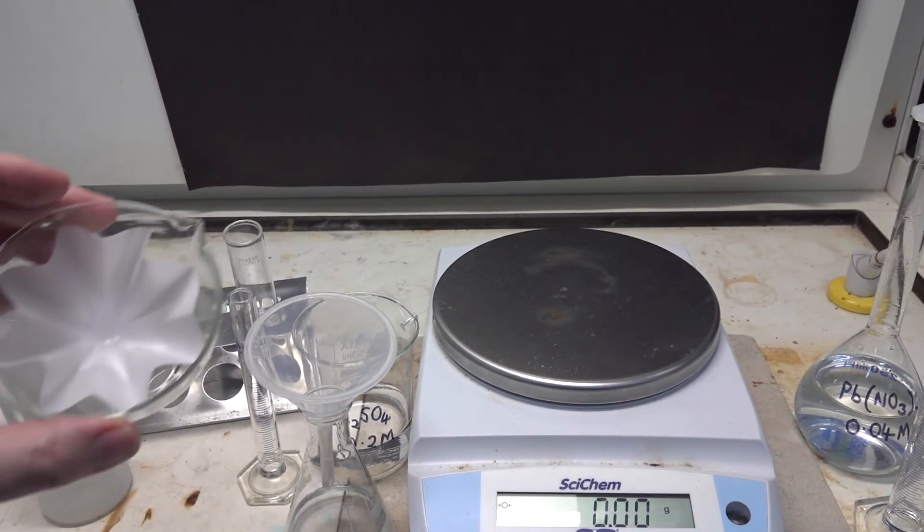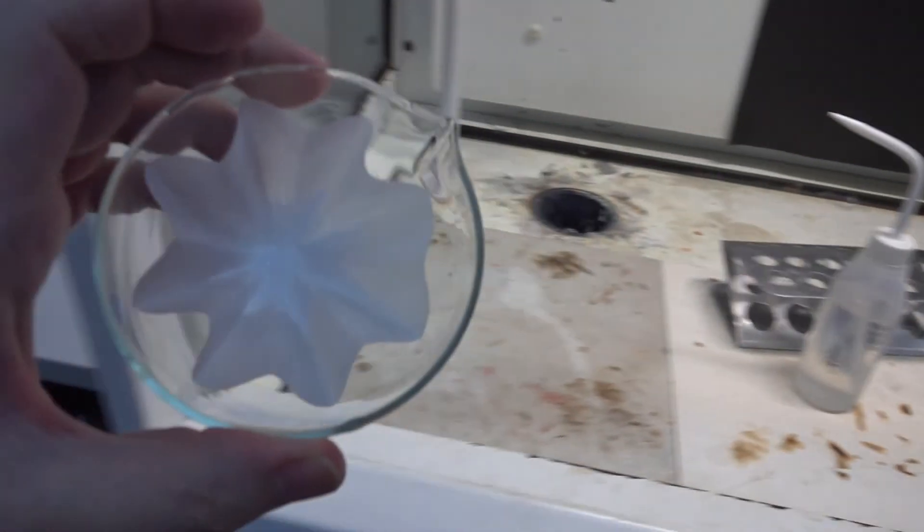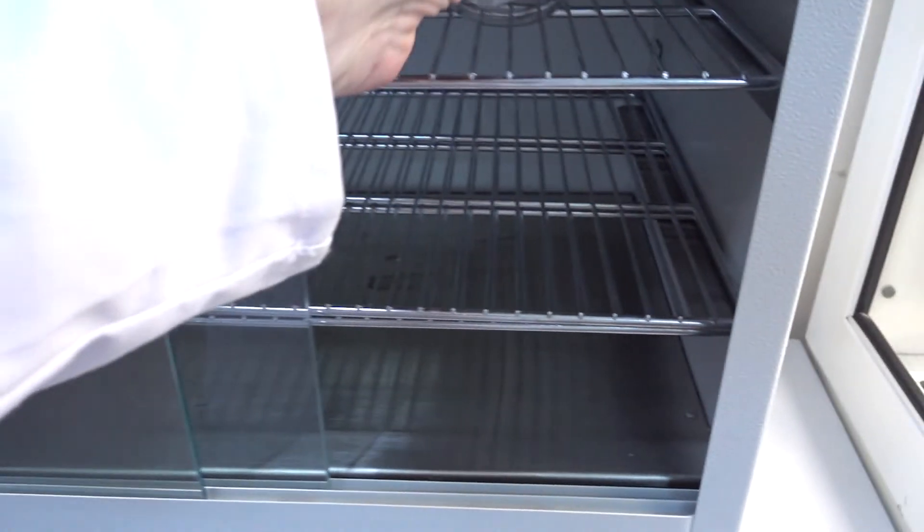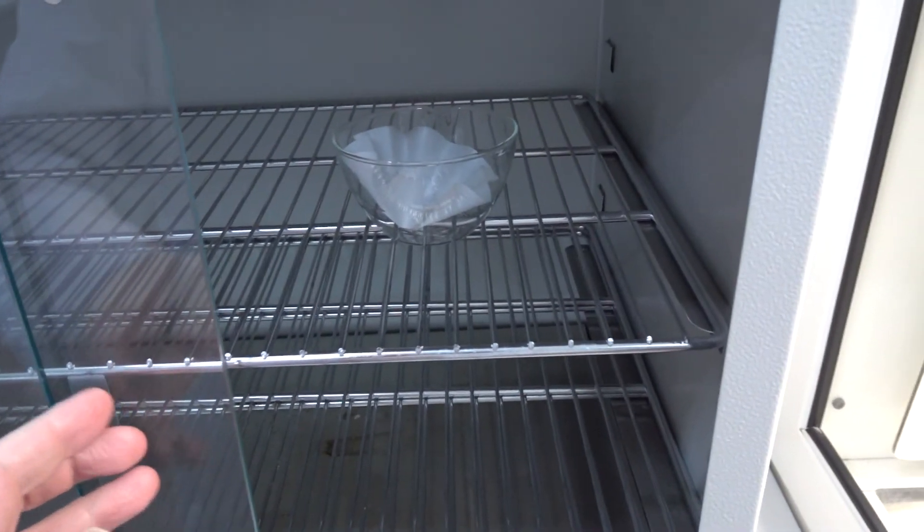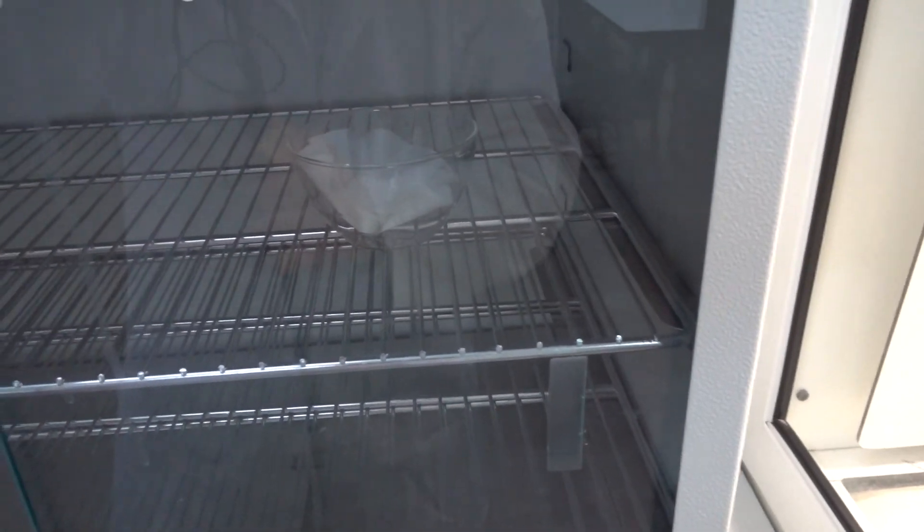Well, let's transfer the precipitate to the drying cabinet, which is over here. So in it goes on the top shelf, and we leave it to dry completely.